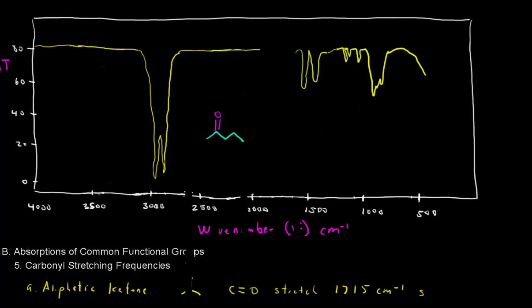The carbonyl stretching frequency in 2-pentanone is very close to 1715, it's 1725, so just slightly higher frequency than acetone. It's very strong and looks something like that. So that's your carbon-oxygen double bond stretch. And that's pretty typical. Ketones and aldehydes look just like this, as do most carboxylic acids, esters, and amides. You have a strong peak in the region of 1700, but there are slight differences between them, and I'll talk about each of those below.